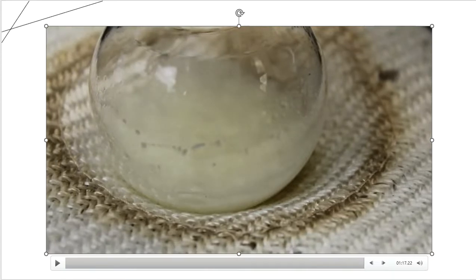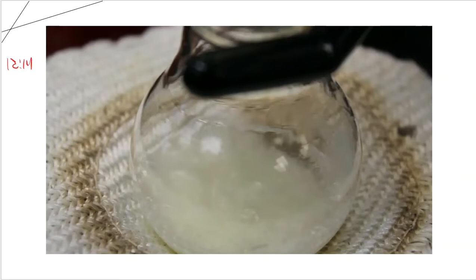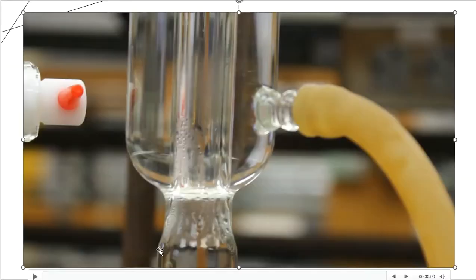All right, folks, so this process started for me at 12:14 p.m. in the afternoon. So that will just give you a timestamp on when this process actually began to reflux, meaning it's starting to boil and I'm seeing the first drip from my condenser. That is when I clock the time. And this happened or started happening at 12:14 in the afternoon.